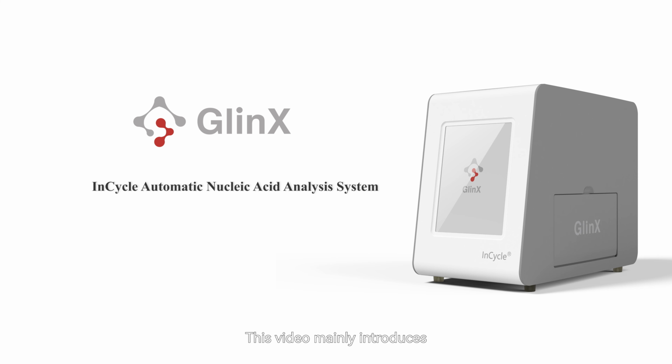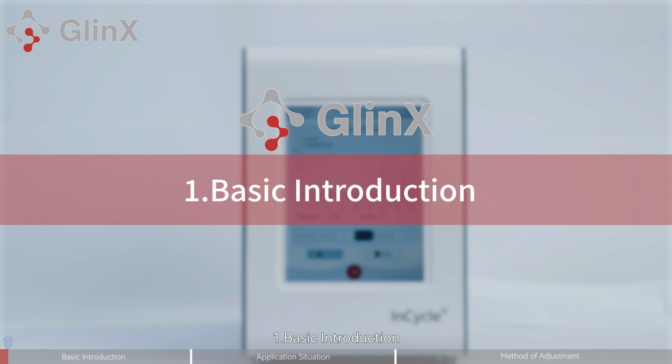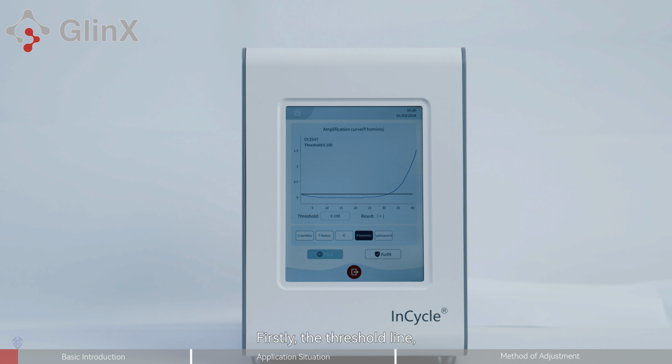This video mainly introduces the threshold adjustment of InCycle Nucleic Acid Analysis System. 1. Basic introduction. Firstly, the threshold line, amplification curve, and CT value are introduced.